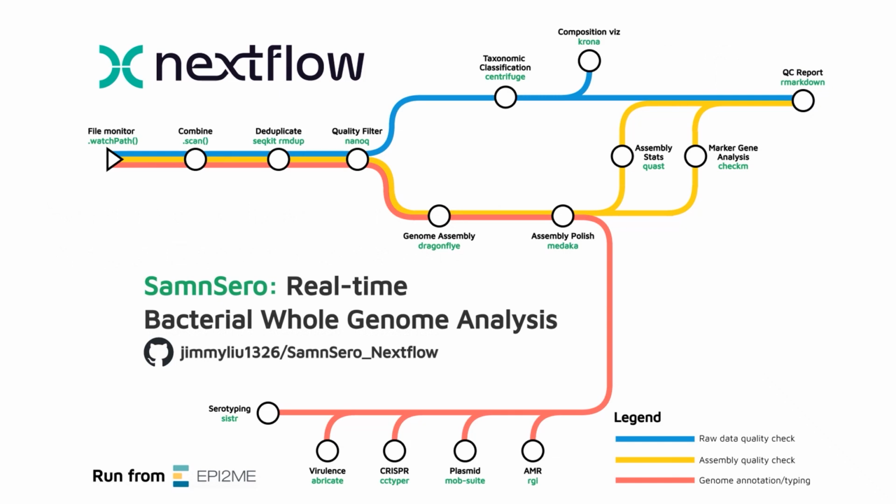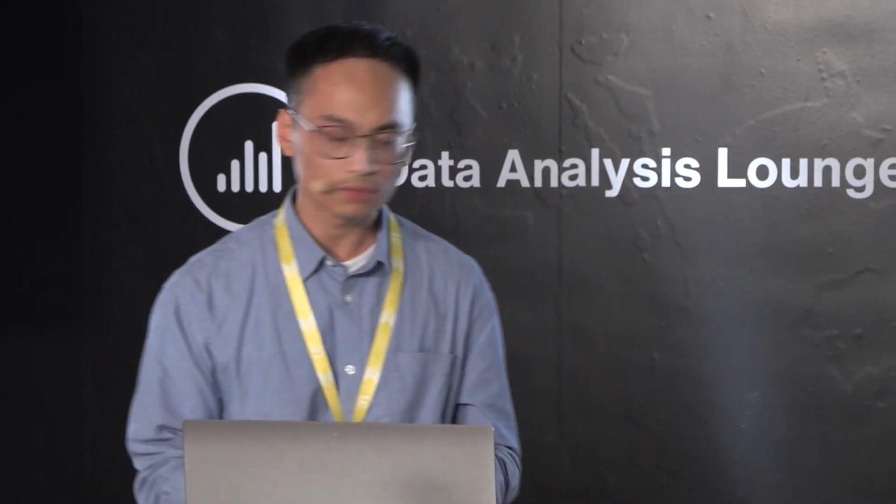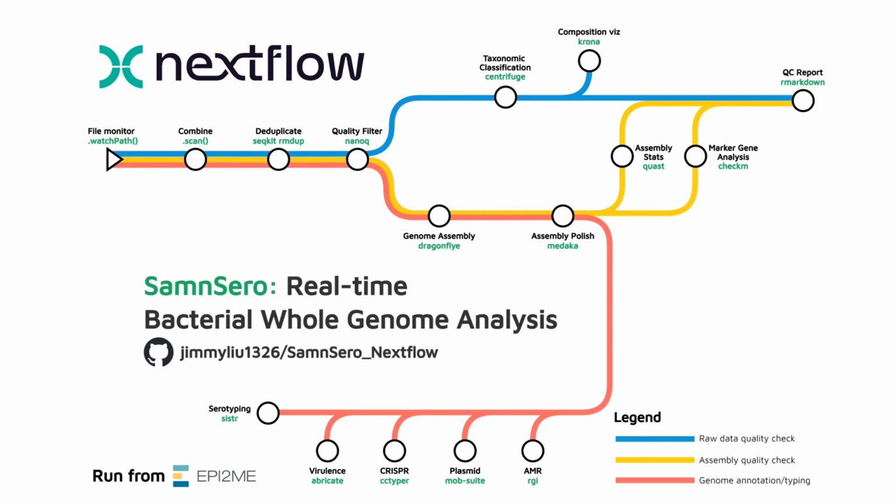As Natalia mentioned, I'm affiliated with a veterinary diagnostic lab in Canada, and we're constantly on the lookout for innovative solutions that can help expedite the detection and the reporting of infectious diseases. And the application that we'll be looking at today is fairly straightforward, but also a very important one. I'm referring to Salmonella serotyping. And so what we'll be looking at today is how do we confidently predict Salmonella serotypes from whole genome sequencing data in real time. And this, of course, is highly critical to our ability to rapidly respond to the emergence of pathogenic strains of Salmonella. So without further ado, let's jump straight into the demo. So let's switch over to my computer screen.